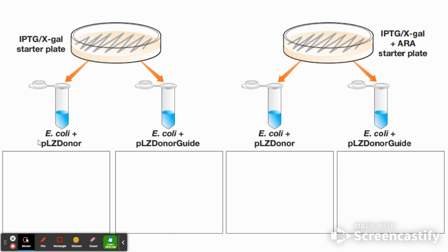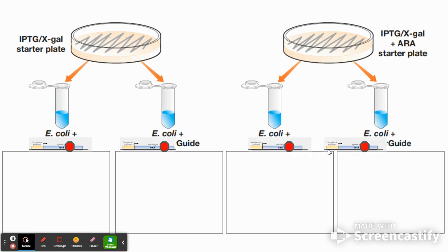A plasmid is a circular chromosome that you see in prokaryotes, especially bacteria. And in this case, the plasmid that we had engineered had that early stop codon. In fact, for the plasmid donor, all four of our plates were plated with microtubes that have that non-functional LAC-Z. So it's present.